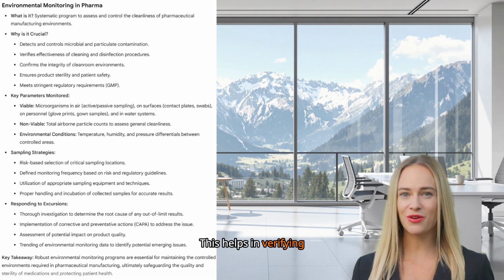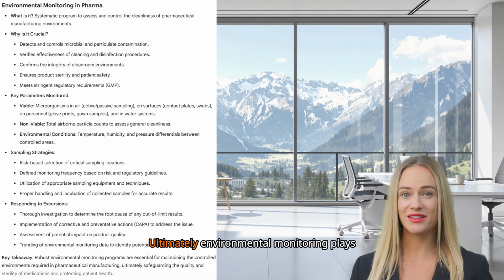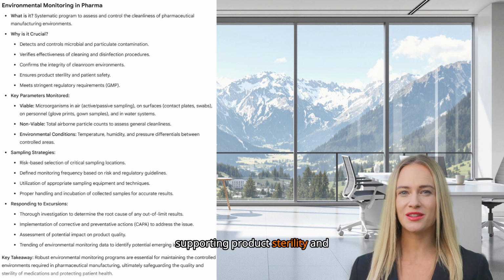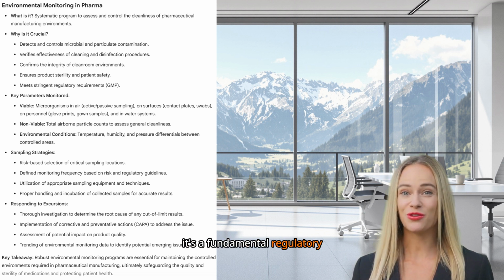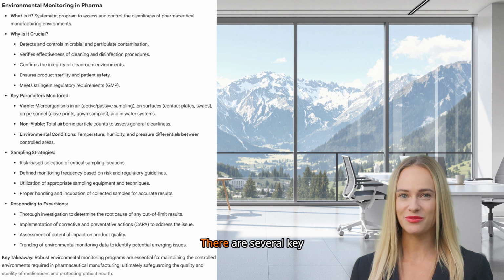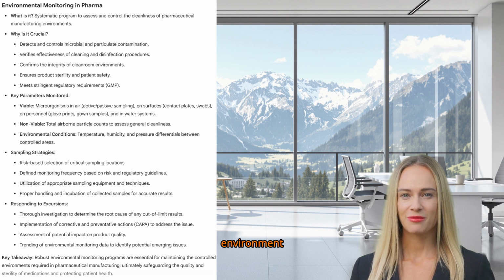This helps in verifying the effectiveness of cleaning and disinfection procedures, as well as confirming the integrity of the cleanroom environment. Ultimately, environmental monitoring plays a crucial role in supporting product sterility and overall patient safety, and it's a fundamental regulatory requirement across the globe.